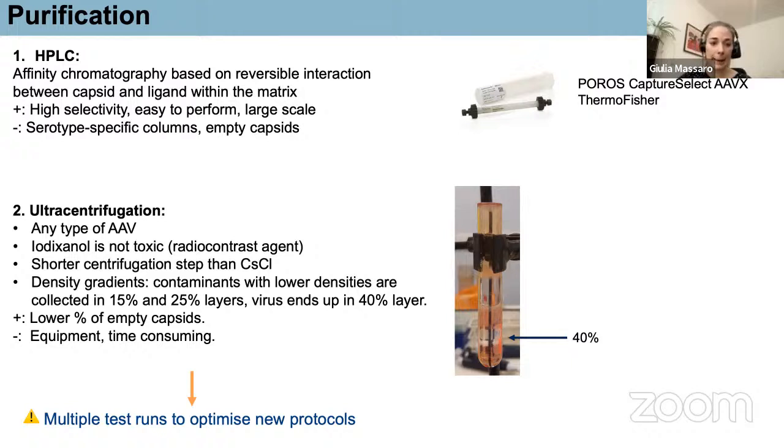Although I've been making virus for the last 8 years, way before the facility opened, and I had a very well-established protocol, literally 2 doors down the lab in Professor Rahim's research group lab, just the fact that we move from one tissue culture to another, one centrifuge to another, using the 17 ml Beckman tubes instead of the 14 ml Beckman tubes, all of this changes the protocol.